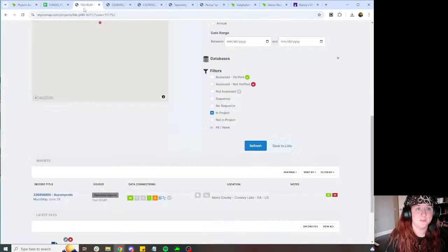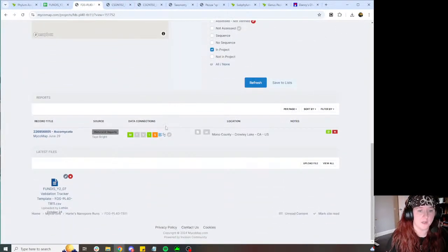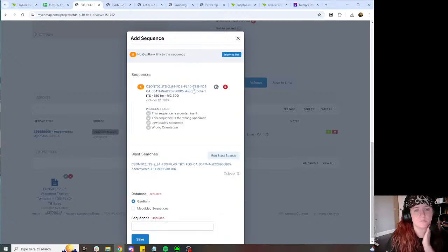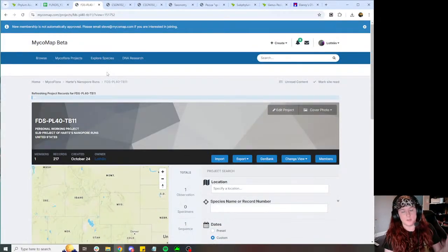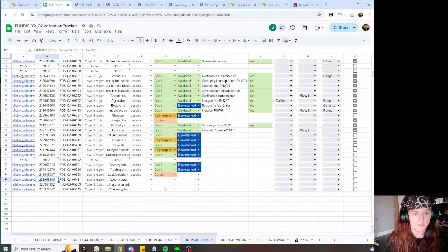We're trying. It requires a special kind of nerd, but we are definitely trying. Part of the reason I've been trying to do streaming is just so if we have people that want to go through and validate their own sequences, because this stuff is becoming a lot more accessible. You can get a nanopore if you have a couple grand to drop. The MinIONs are only a couple thousand dollars. They're actually approachable for a layman to purchase if they really wanted to.